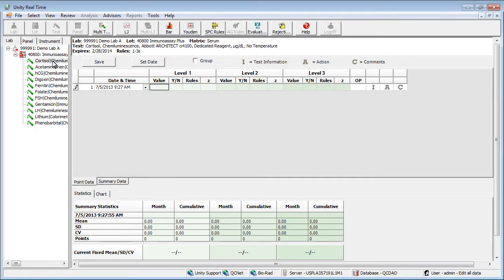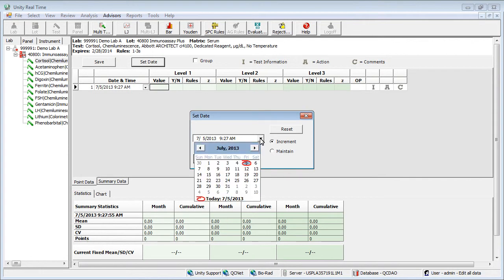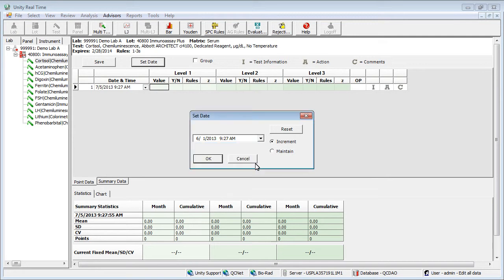To enter data, you'll need your date. We'll use the Set Date button. The drop-down calendar allows you to choose a date. Click OK.